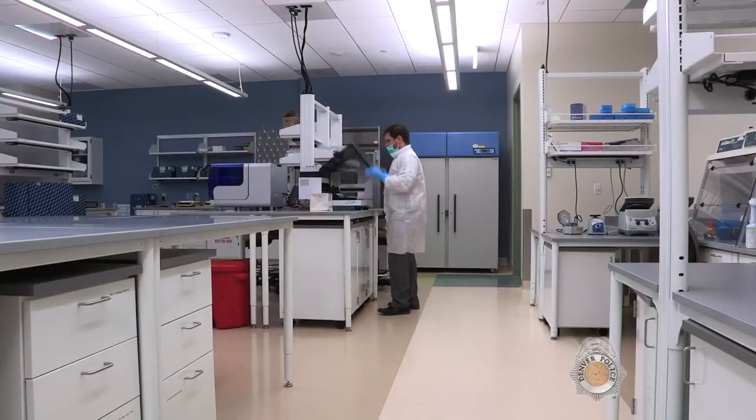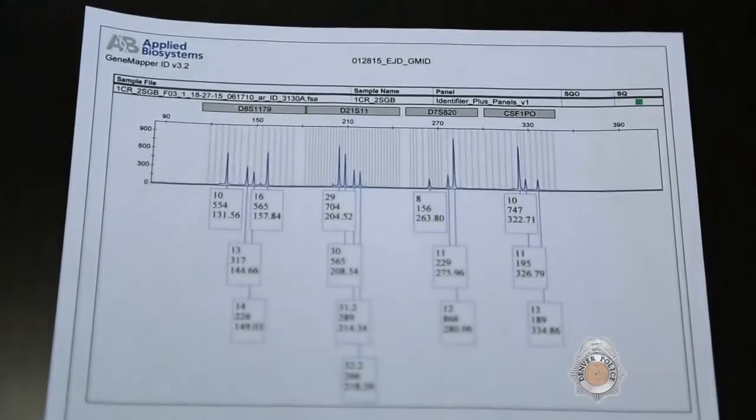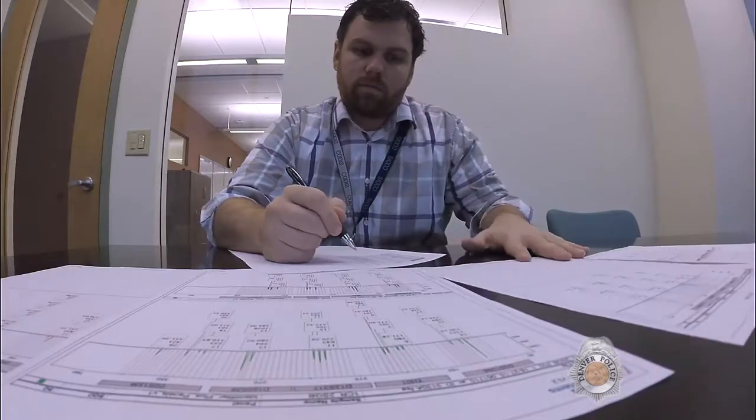Cases that test positive in the Forensic Biology Unit go on to Forensic DNA Analysis. The goal of the DNA Unit is to develop DNA profiles from items of evidence and compare them to known DNA profiles from crime investigations.